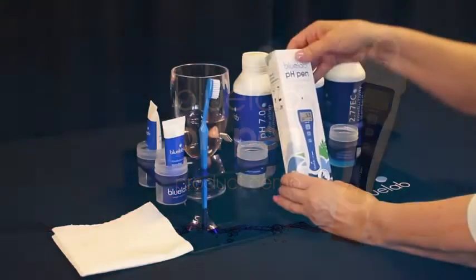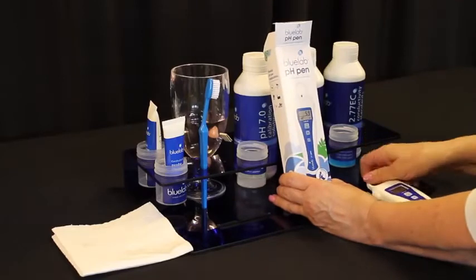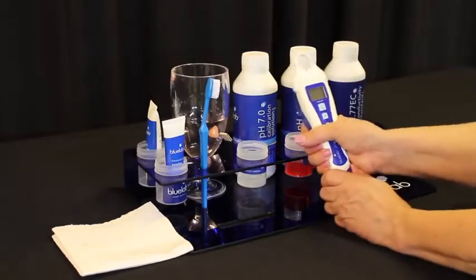Hello and welcome to Bluelab's video on how to calibrate the Bluelab pH pen. Remove your pen from the box and remove the cap carefully by pulling it back and forth.